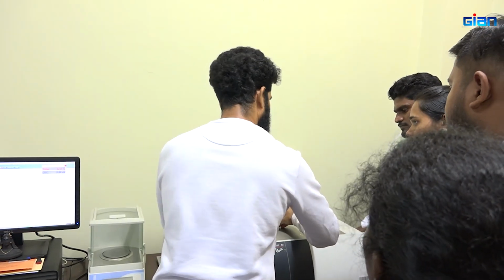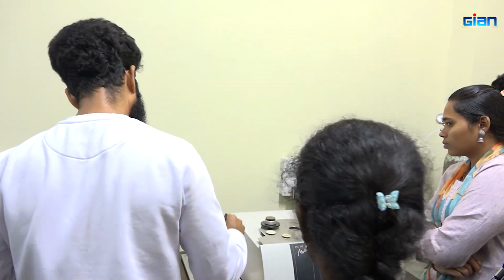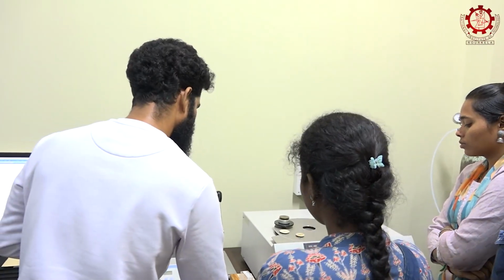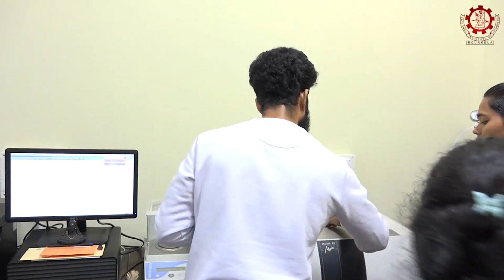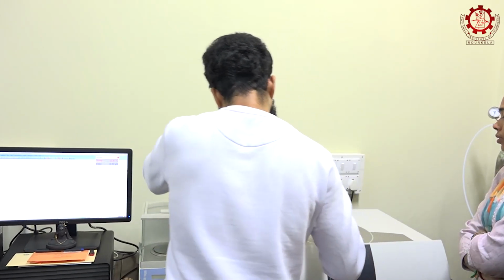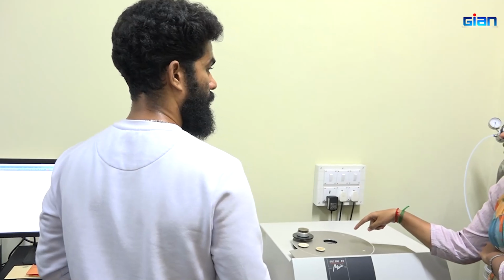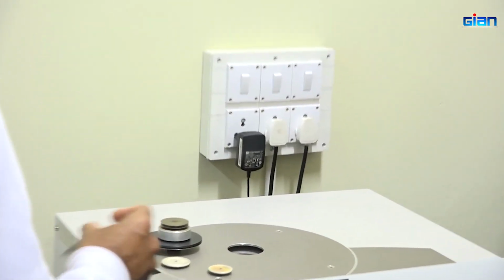This is the empty pan. So we put the sample over here. This will measure the difference between the control and the sample.